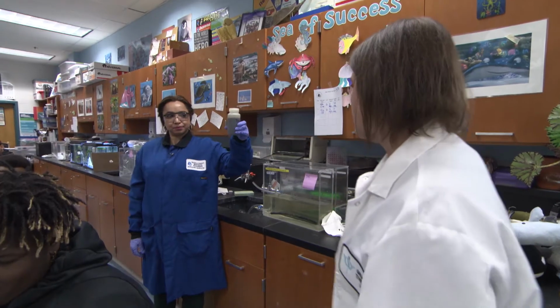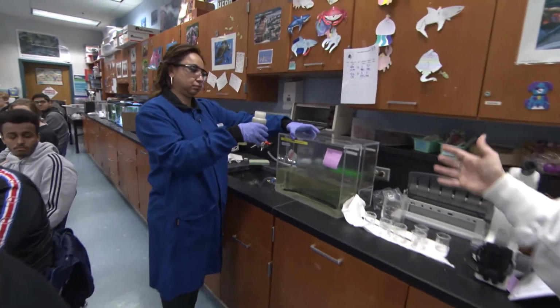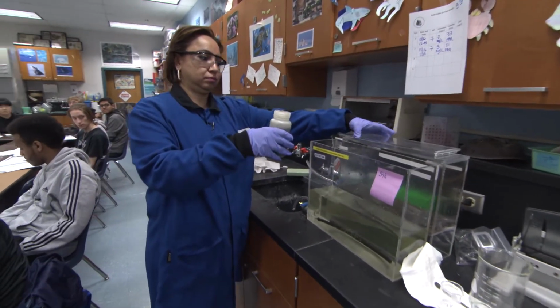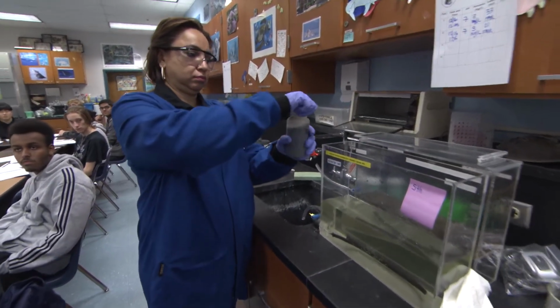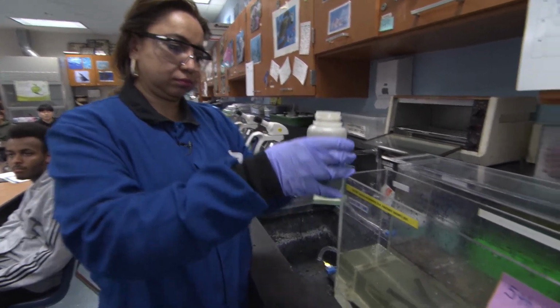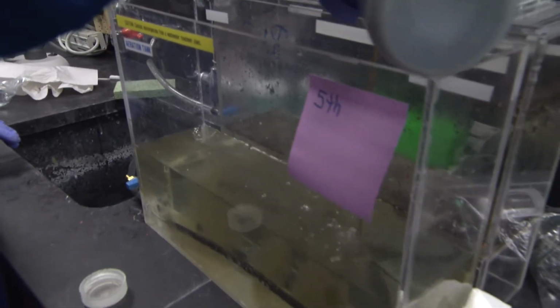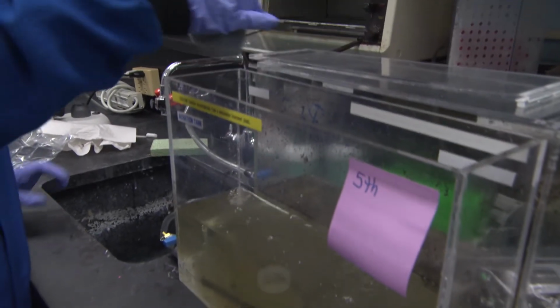So what we're going to do is, since I'm not gloved, Reed is going to pour about 50 to 75 mils of this RAS sample in. RAS is returned activated sludge, and we actually get this from the wastewater treatment plant. There's probably a little valve that we can pull it off, right?